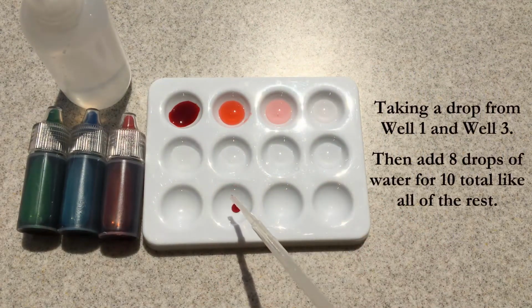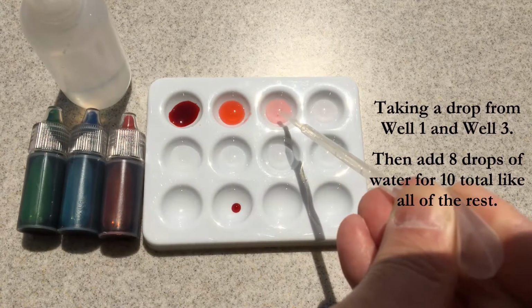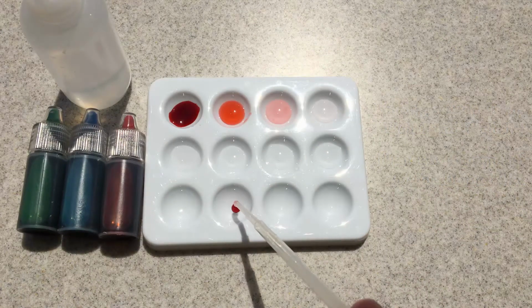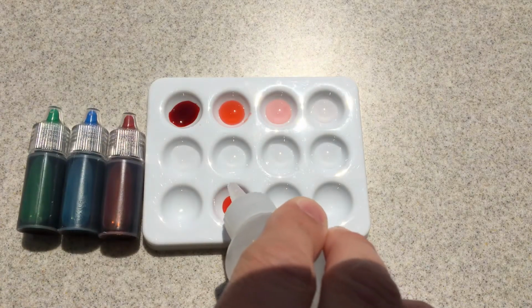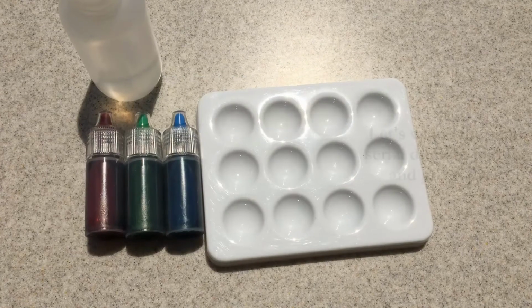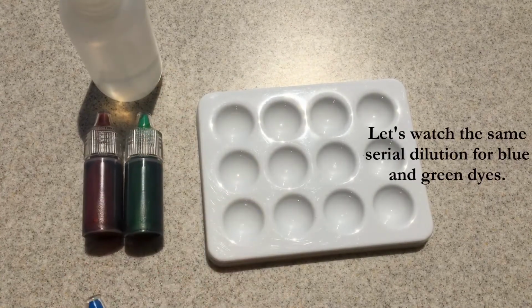White light. Now what you see going on right now, we're going to take 1 drop from well 1 and 1 drop from well 3. We'll then add 8 drops of water to make sure we have our total of 10, and you'll be asked to determine what the concentration as a percentage is that is red dye. I did not do this for the blue or for the green, so please come back and take a look at what happened with the red dye.